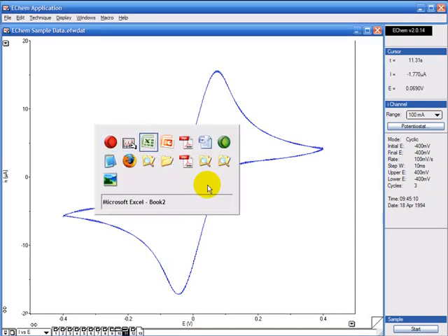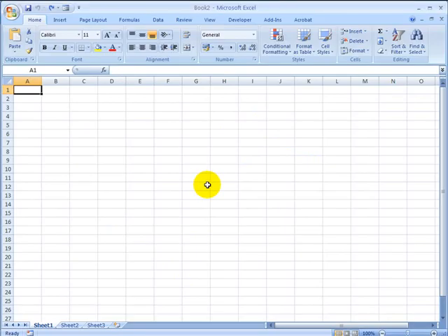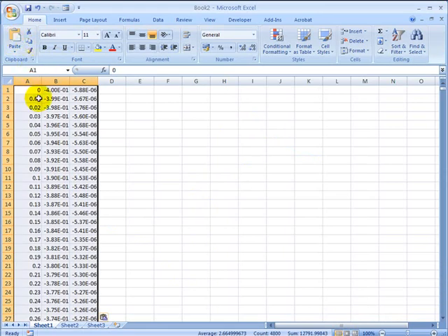If you open Excel, you can paste that directly in. So here we've copied the time, the voltage and the current and you can re-plot that.